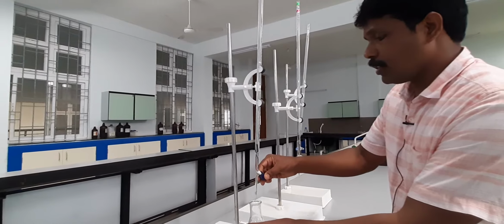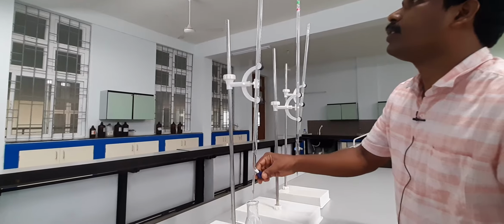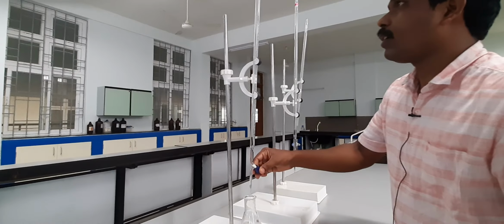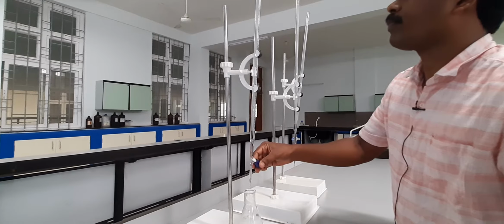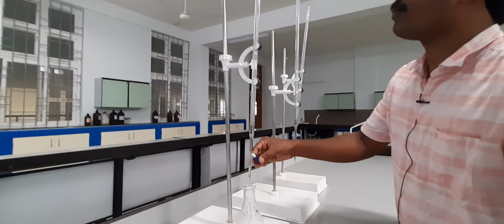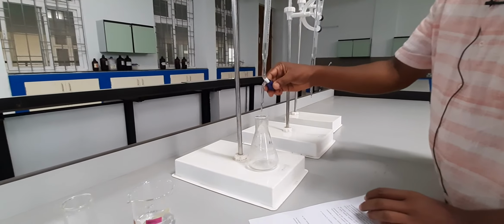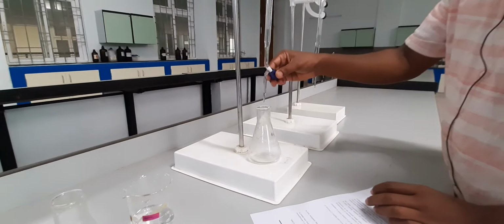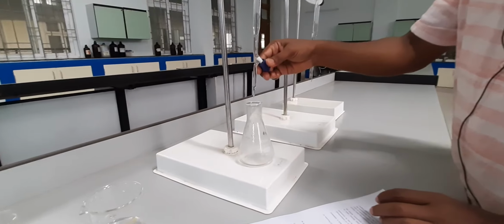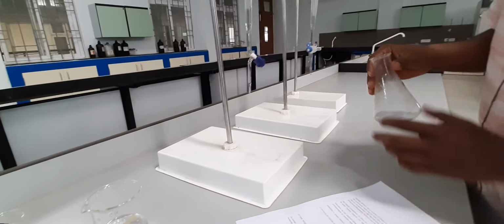So I am just trying to dispense approximately 10 ml of acetic acid from this. As it is reaching 10, you have to slow down the speed. So it is now 10 ml that I have dispensed into this conical flask.